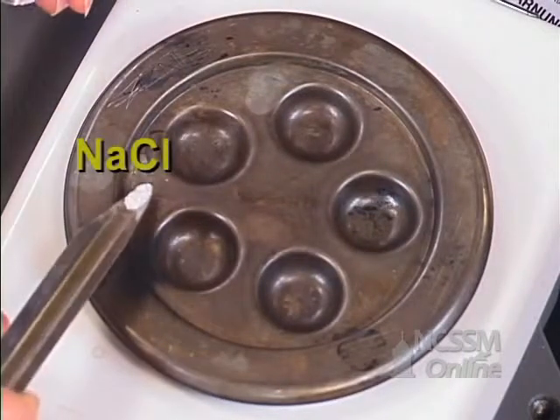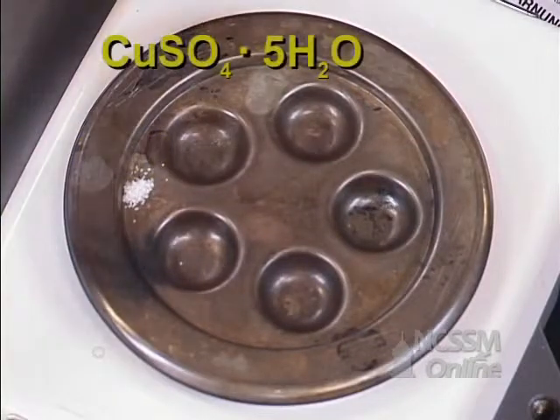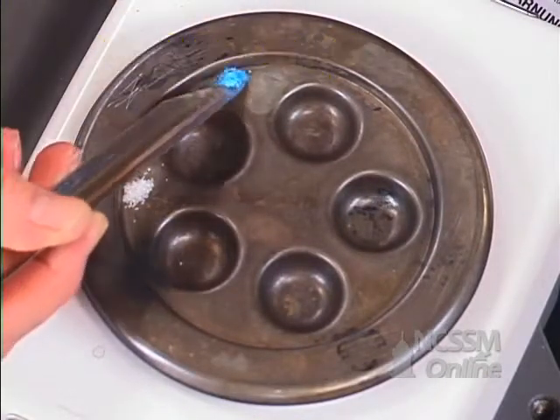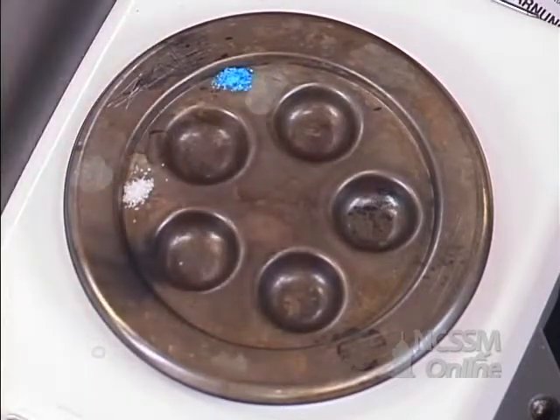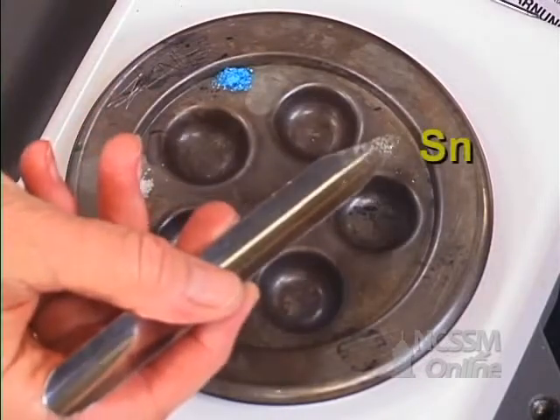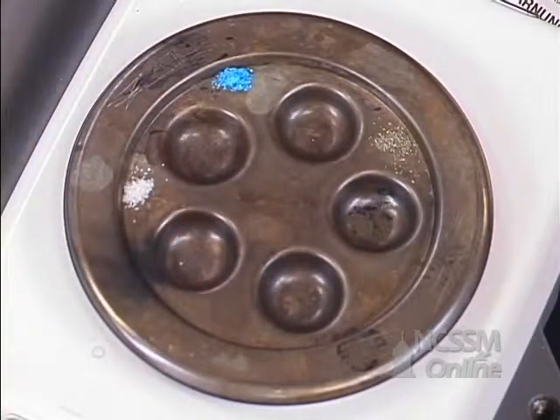Sodium chloride, just put a little here. Copper sulfate pentahydrate, a nice pretty blue. These are two ionic compounds. The third one we're going to put is tin, which is a relatively soft metal.